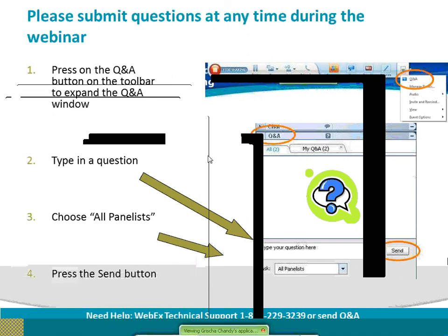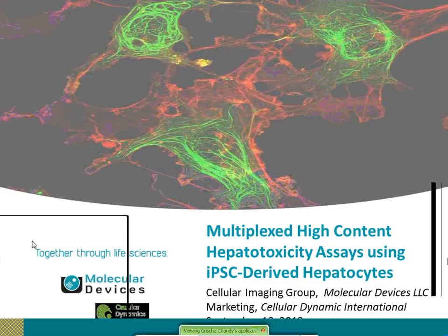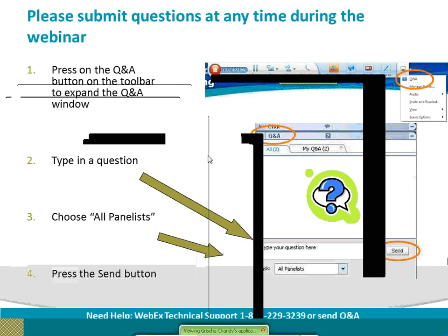This is a question directed at Vanessa. I think there's a background of variability in hepatocytes that you might want to have cells from with different genetic backgrounds. Is there a way to do assays with cells that derive from different donors, maybe?